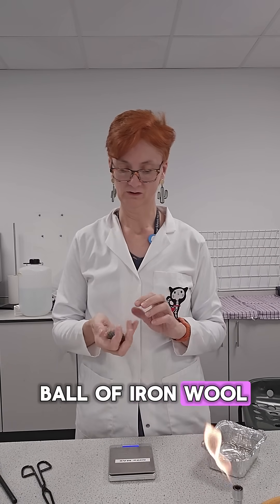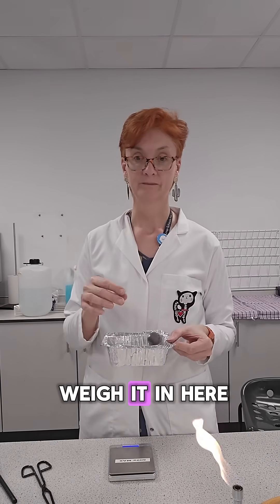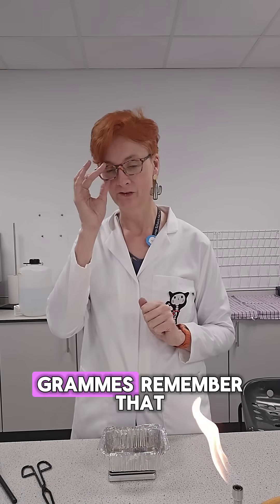Get ourselves a little ball of iron wool. Not nice like wool. First of all, we weigh it in here — a takeaway container, unused. And it is 6.39 grams. Remember that.